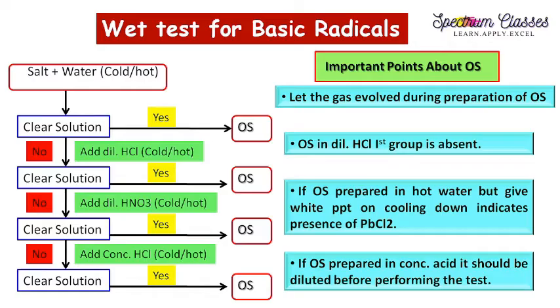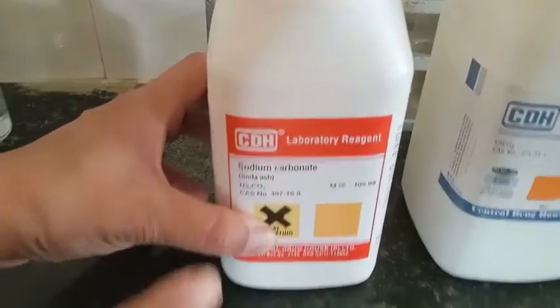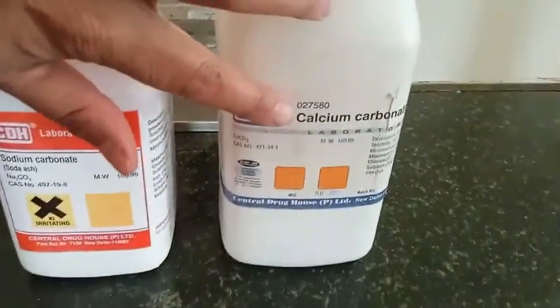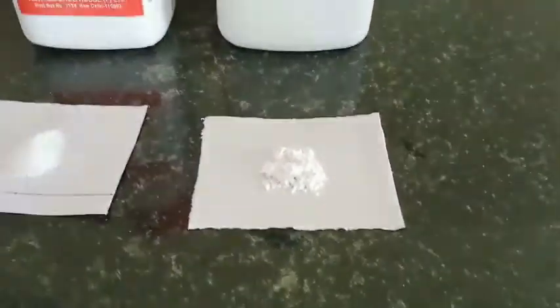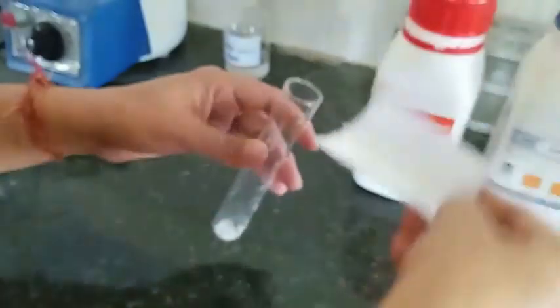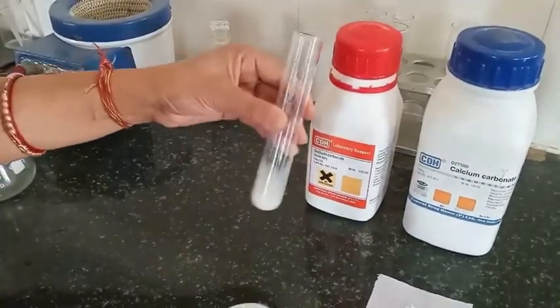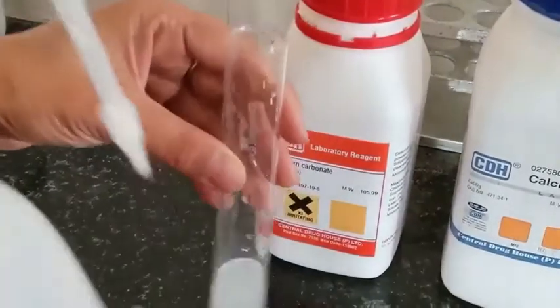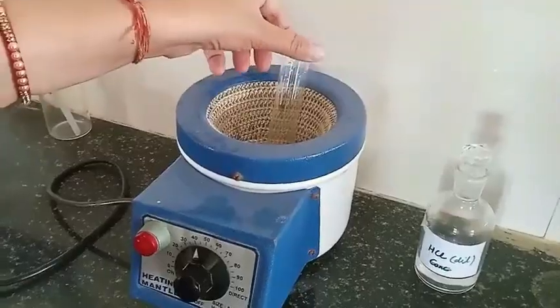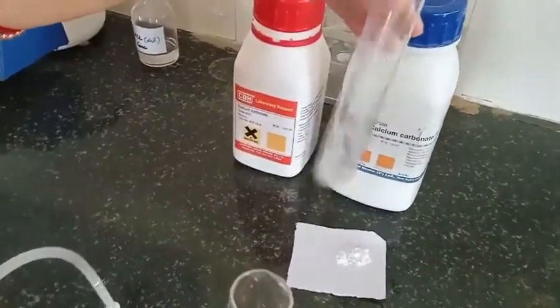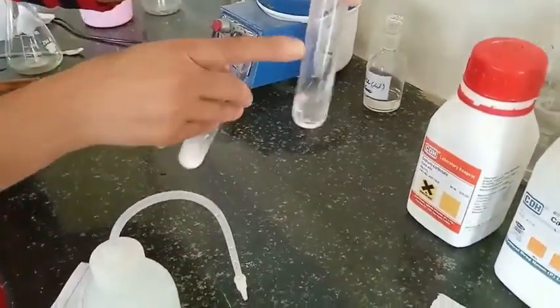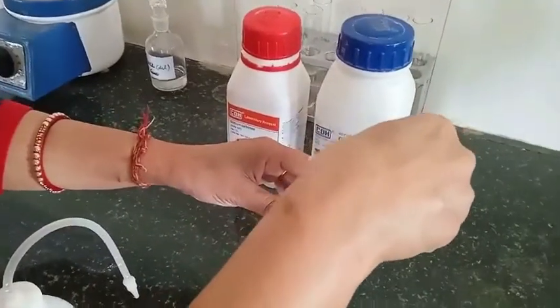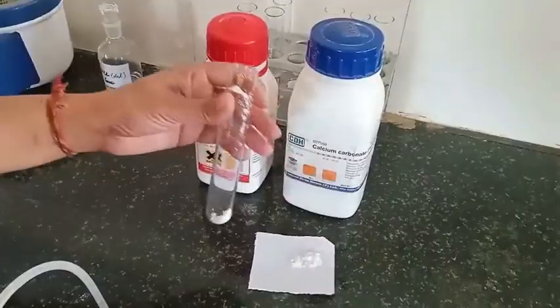Let's start with the lab activity to prepare the original solution. I am preparing the original solution for two salts: sodium carbonate and calcium carbonate. I have taken sodium carbonate and added cold water to it. It shows that we are not getting a clear solution in cold water, so I am going to heat this. You can see sodium carbonate is almost clear in hot water, so we can use it as the original solution.